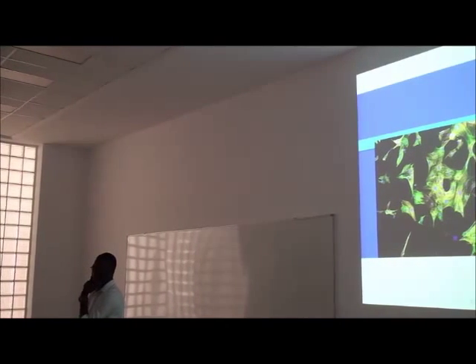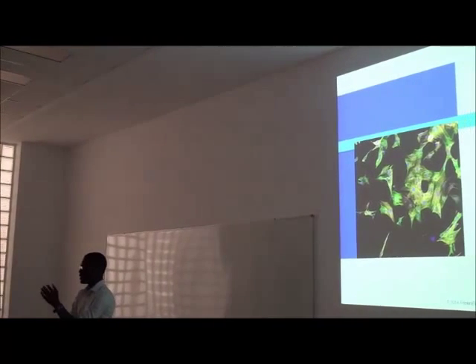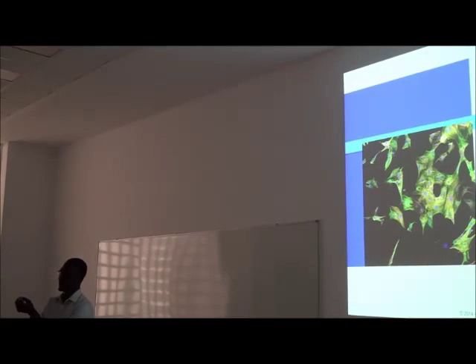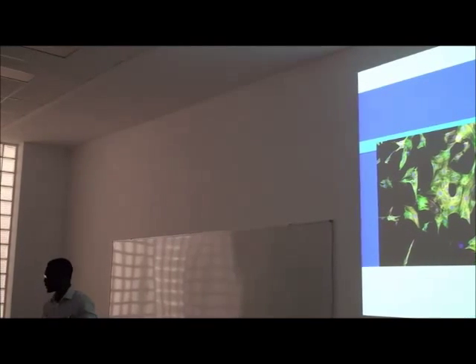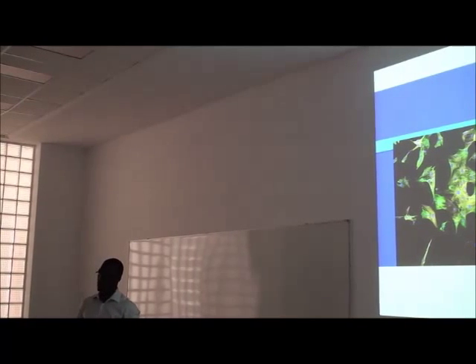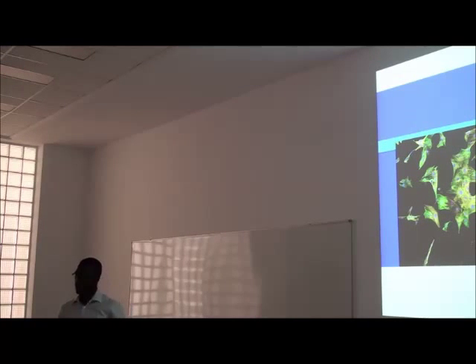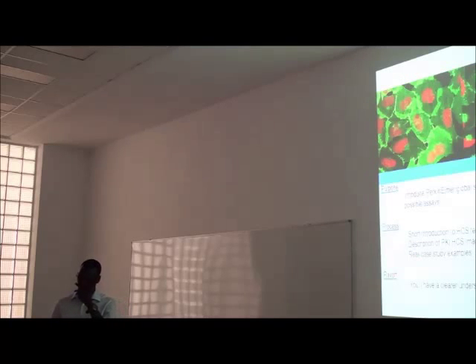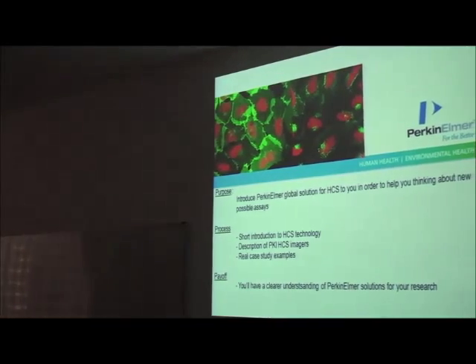As already said by Elena, my goal here is to give you an introduction to a technology called HCS, for high content screening. A lot of people don't know high content screening, but you all know microscopy, wide field microscopy. This is just a complementary technology, which I'm going to introduce here. I'll also take the occasion to talk about the systems that Perkin Elmer is proposing. That's the purpose, process and payoff of this session.